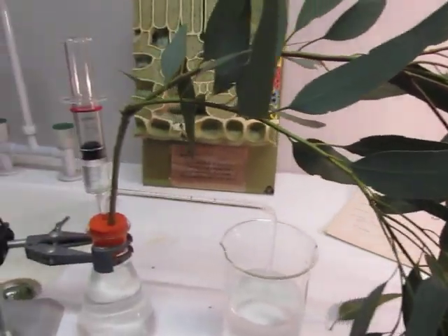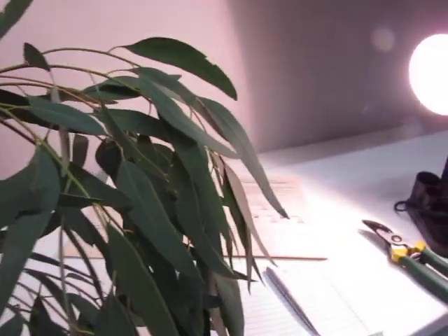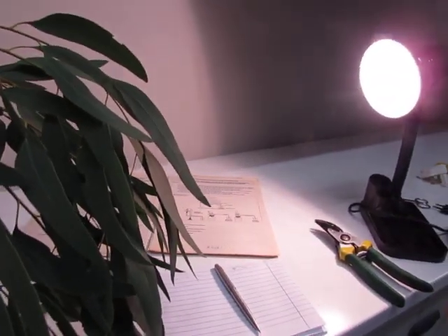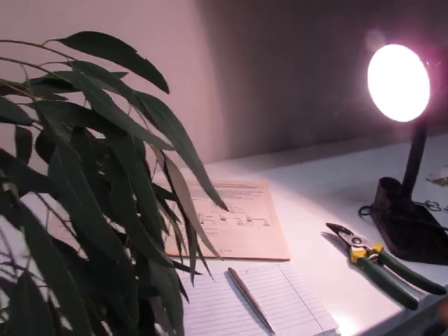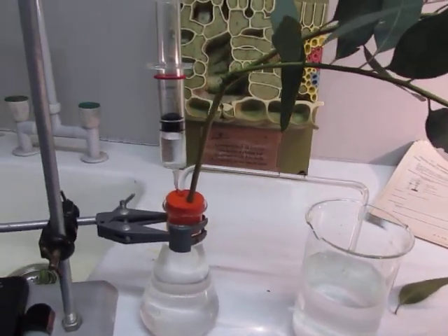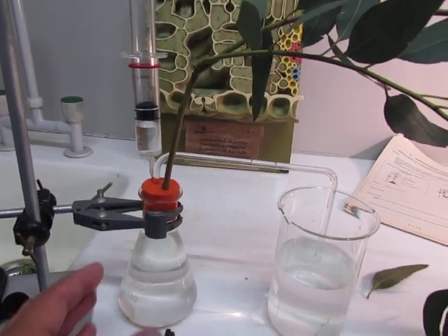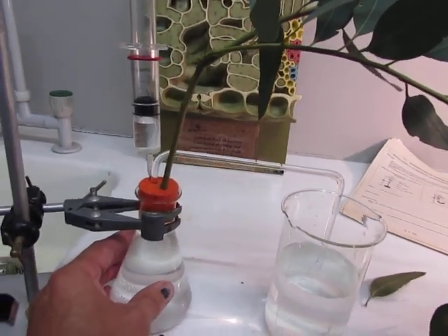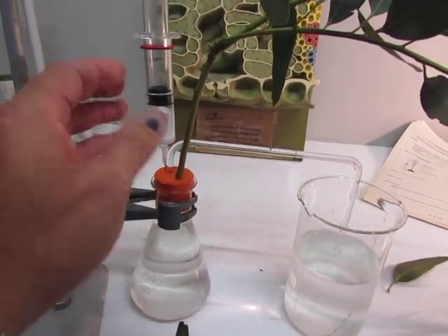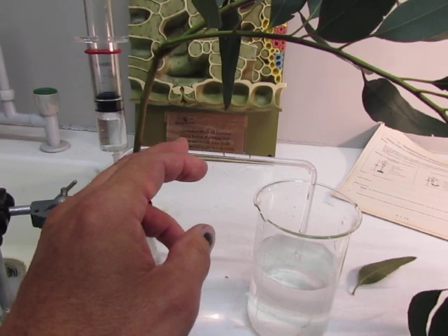The aim of today's experiment is to determine the influence of various environmental factors on the rate of transpiration by means of a potometer. Now, if you look at this apparatus, you'll see this is a potometer. We have a flat bottom flask here, and then a rubber stopper with two holes in it, and then a syringe, and then a capillary tube.